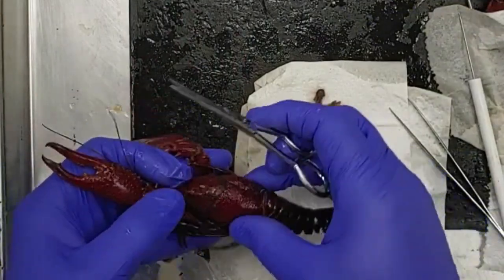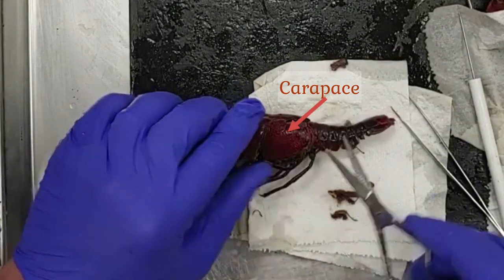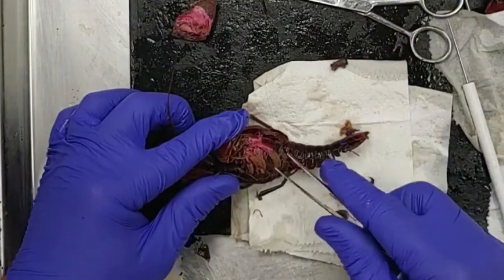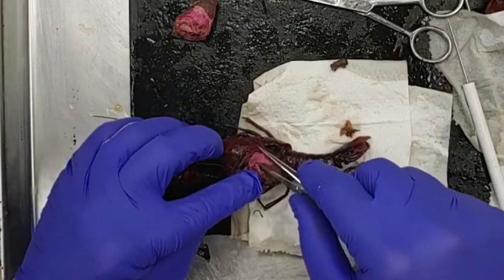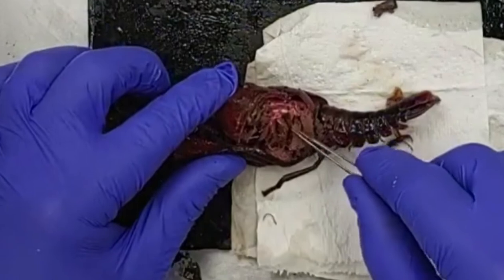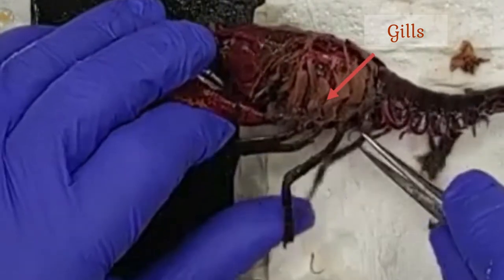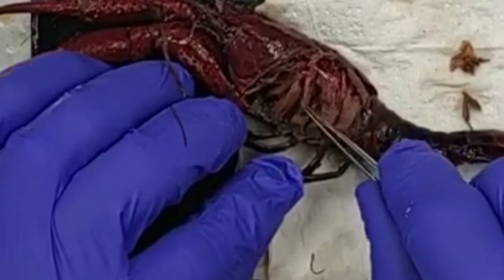Now we're going to take a look at the gills. The gills are hidden underneath the carapace, which is the exoskeleton of the head projecting backwards to cover the thorax. The carapace protects the delicate feathery structures of the gills and creates channels through which water can flow and circulate around the gills constantly. We'll pull away the latex from the circulatory system injection so we can see the delicate feathery gills. Each gill is associated with one of the appendages — there's an internal branch of the gills hidden underneath the carapace that you won't see unless you pull it back.